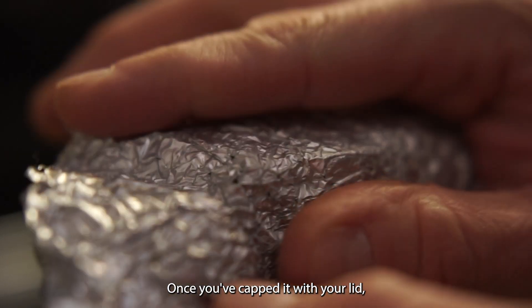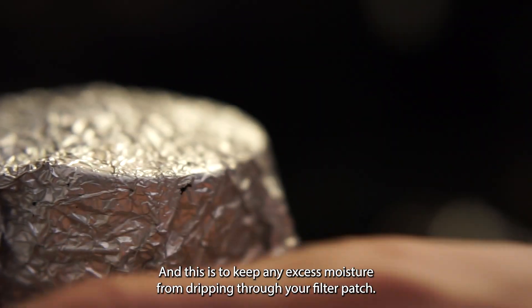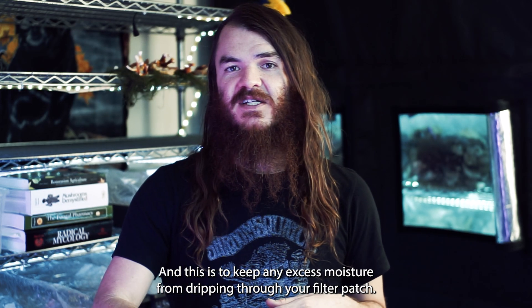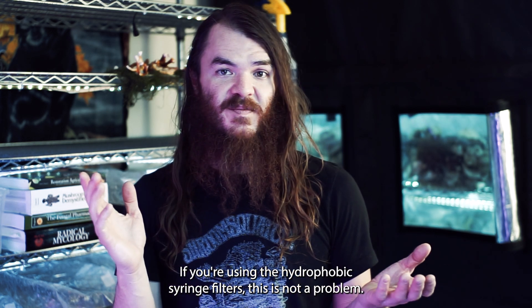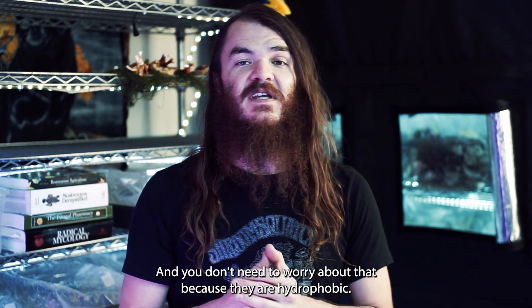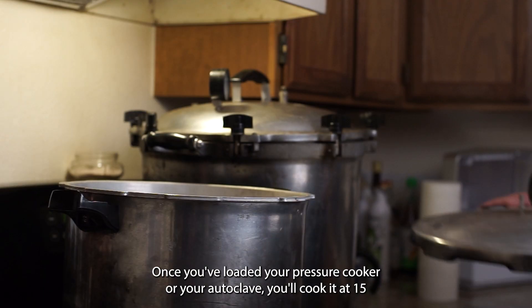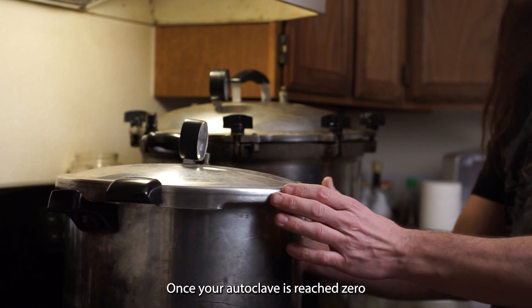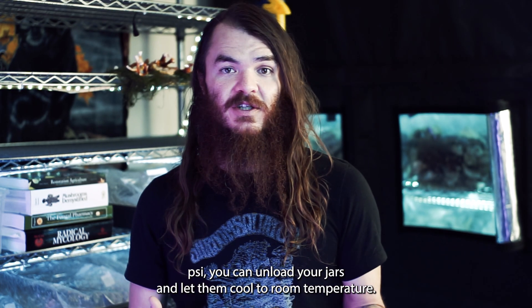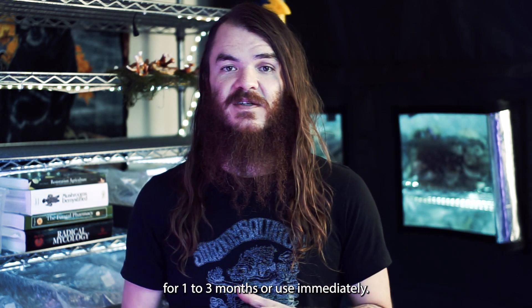Once capped with your lid, add a small piece of foil over the top to keep excess moisture from dripping through your filter patch. If you're using hydrophobic syringe filters, this isn't needed since they are hydrophobic. Load your pressure cooker or autoclave and cook at 15 PSI for 90 minutes. Once the autoclave reaches zero PSI, unload your jars and let them cool to room temperature. Then you can either store your jars for one to three months or use them immediately.